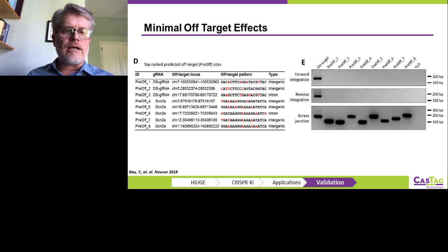The other note that I'll make on off-target effects is that in labeling experiments for knock-in type experiments, each cell is an independent event. And so if your labeling is consistent across multiple different cell types, that's generally going to be the correct fusion. And so, in a way, you almost have a built-in experiment to verify independently multiple different events that the labeling is effective and robust.